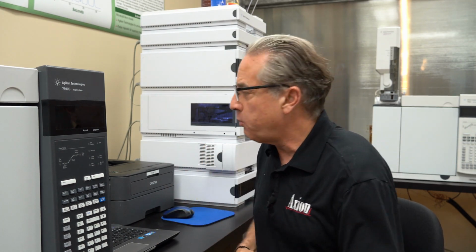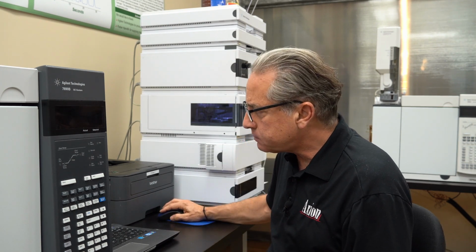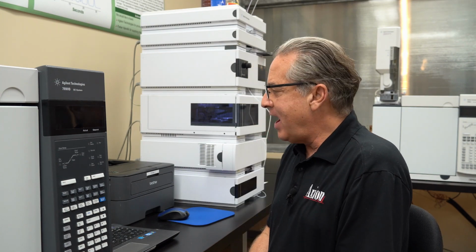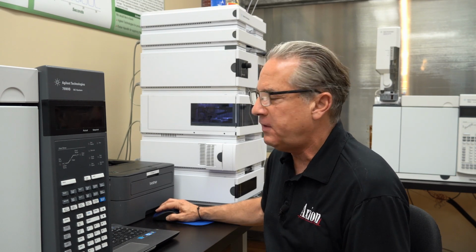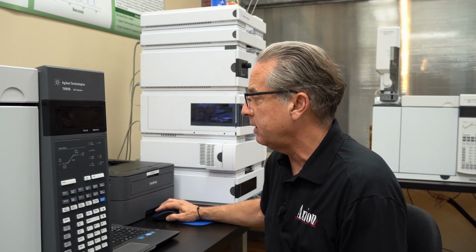Every software package out there that's used for chromatography has this capability. I'm going to show you my version of it. This is the Agilent ChemStation B.04.03, and let me show you how to build a 4-point calibration. This is a series of standards that have already been run on this instrument. They were caffeine standards, in microgram per mil or part per million: a 50, 100, 250, and 500 microgram per milliliter standard.